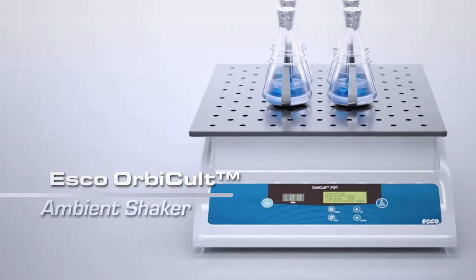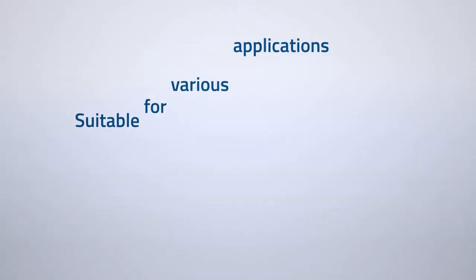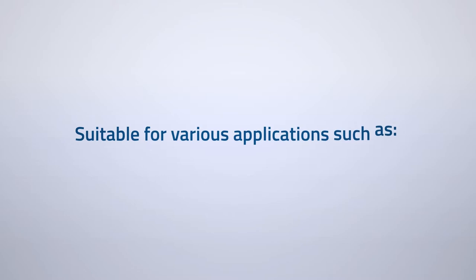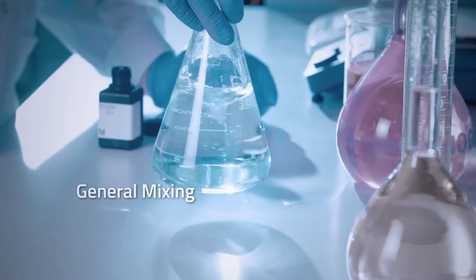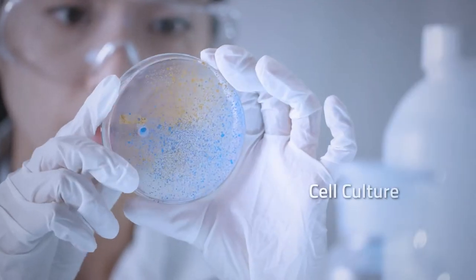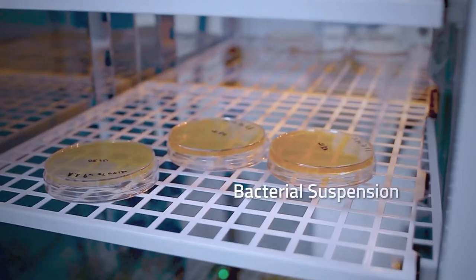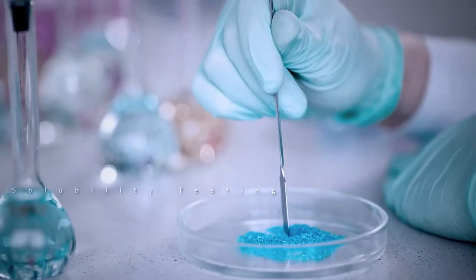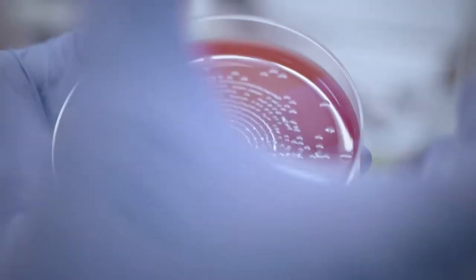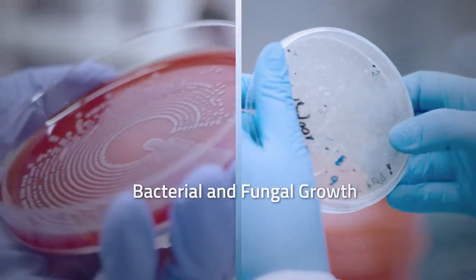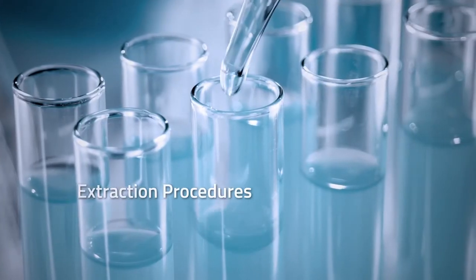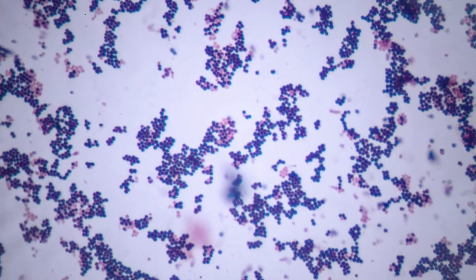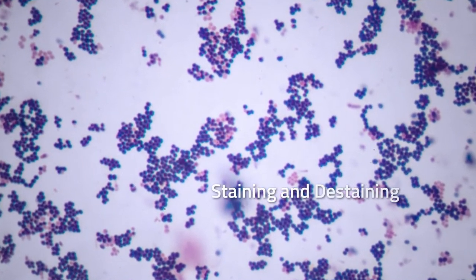Esco OrbiCult Ambient Shaker, suitable for various applications such as general mixing, cell culture, bacterial suspension, solubility testing, bacterial and fungal growth, extraction procedures, staining and de-staining.